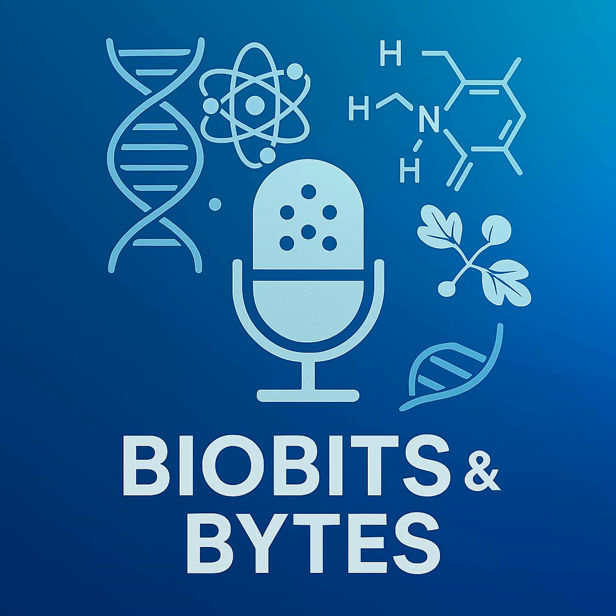And you mentioned it's evolved. Advancements in the technique. Oh, yes. Things like single-cell Western blotting, where researchers look at proteins in just one cell at a time. Huge for studying mixed populations. There are faster ways to do the transfer step, more efficient transfer methods. Ways to look at multiple proteins on the same blot, semi-automated systems to make it easier. And using molecular weight markers, kind of like a protein-sized ruler run alongside your samples, is absolutely standard practice, essential for knowing you're looking at the right band.